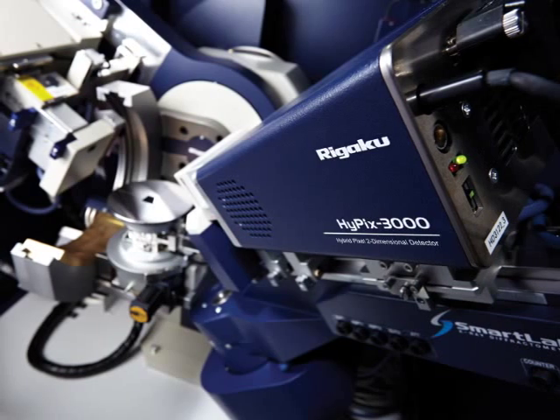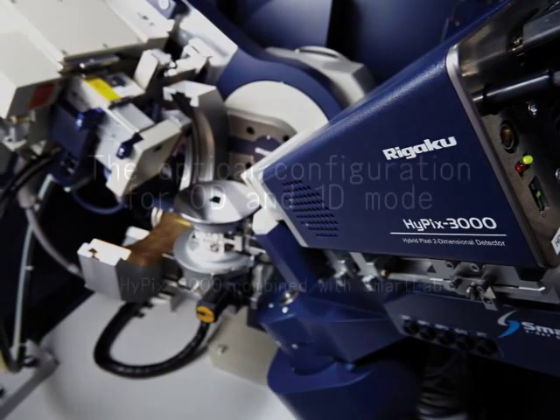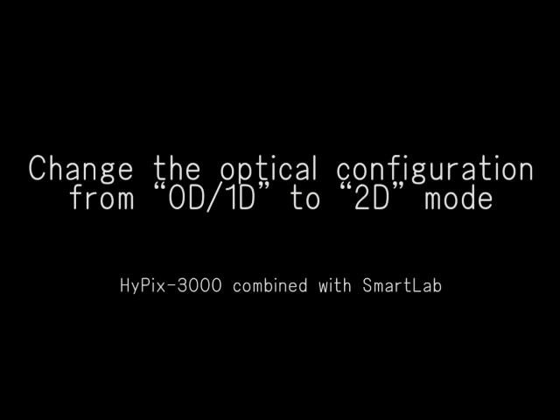The Smart Lab system with Hypix 3000 hybrid pixel array detector allows for zero, one, and two-dimensional diffraction data to be collected with the same detector. The optics hardware for the zero and one-dimensional data collection modes are the same. A change in computer setting is all that's needed to switch between the zero and one-dimensional data collection modes.